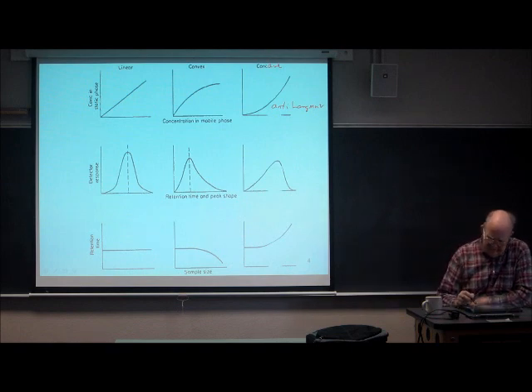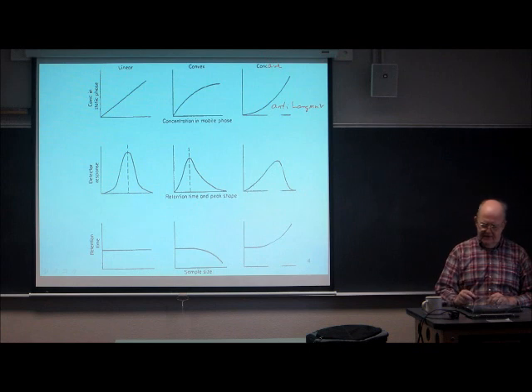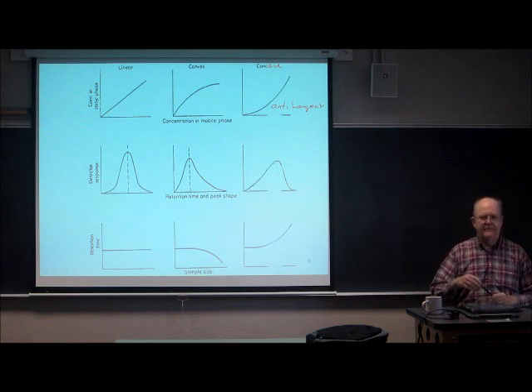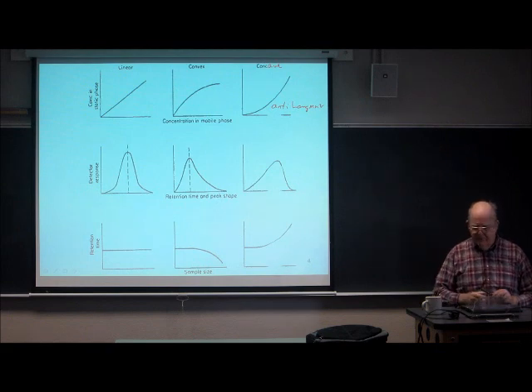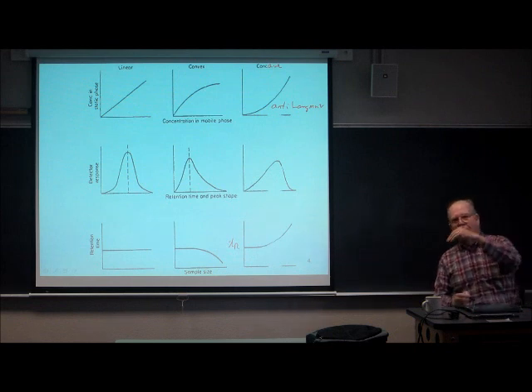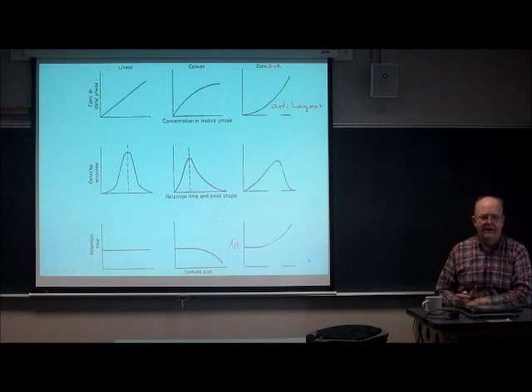So, if you inject too much stuff, instead of having a tail, you have a front. And the front eventually can extend all the way into the dead time of the column. And the peak maximum moves out and out and out, and there's no limit to how far out it can go, theoretically. The retention time, instead of dropping off as you inject more stuff, can shift to greater numbers as more sample is loaded into the column.